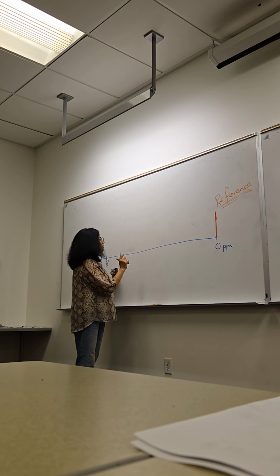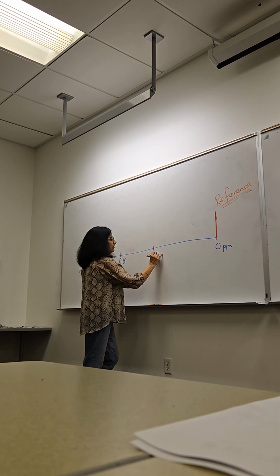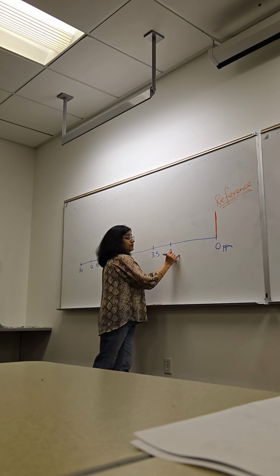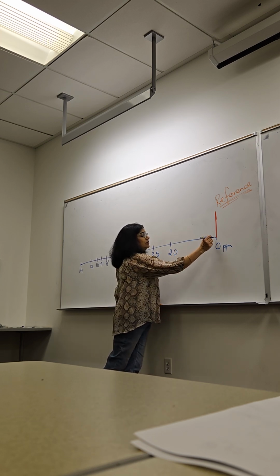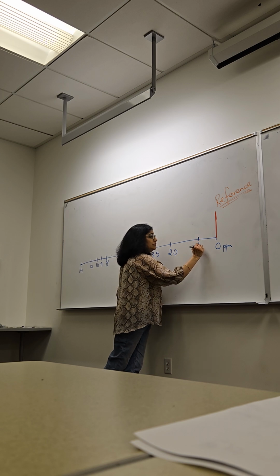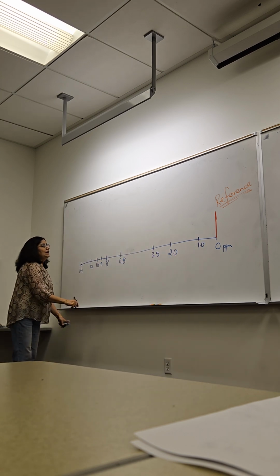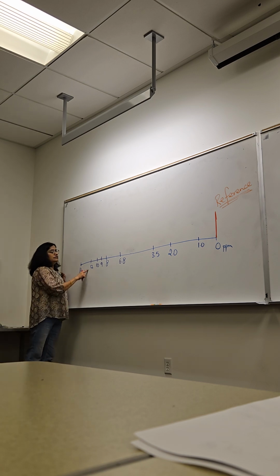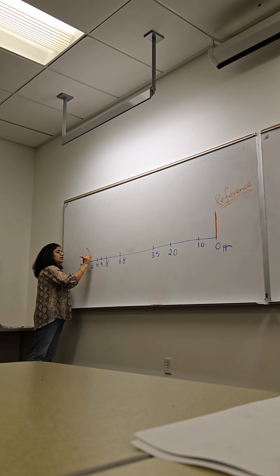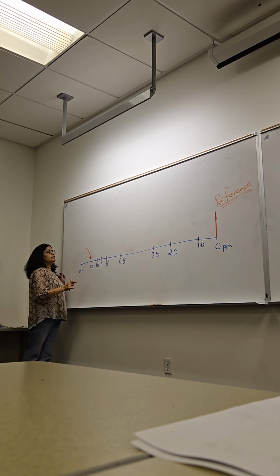And then over here, I really love the 3.5 value. 2.0 is very useful. 0 to maybe 1, so this is obviously not to scale, as you can tell. Why? 12 to 13, this is where the most de-shielded hydrogen shows up.